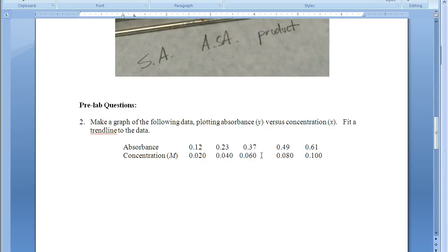And then you'll set your spectrometer specifically to that wavelength, the peak wavelength, to record these absorbances. That'll speed up the process then so that you won't have to take a minute or two to record the entire scan. You can just put the cuvettes directly into the spectrometer and record the absorbance at the one target wavelength.